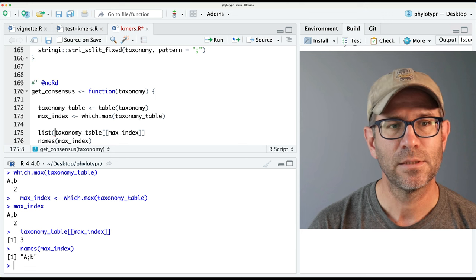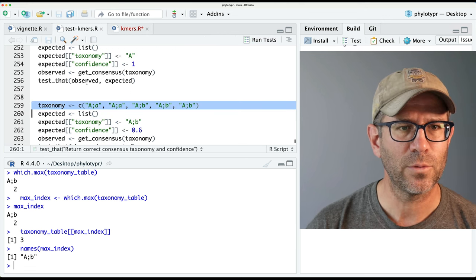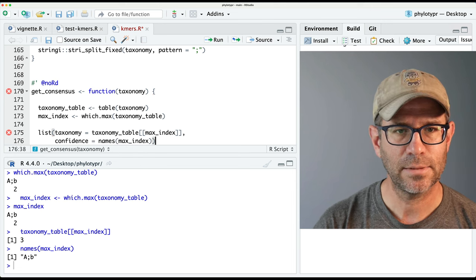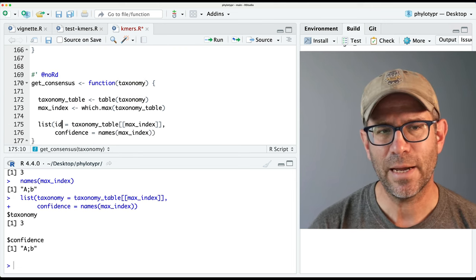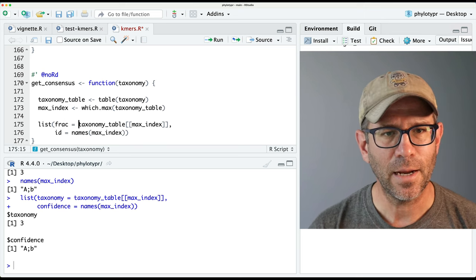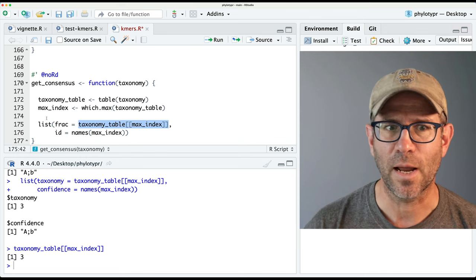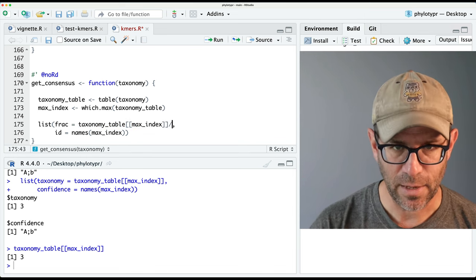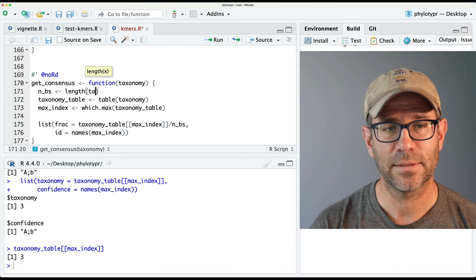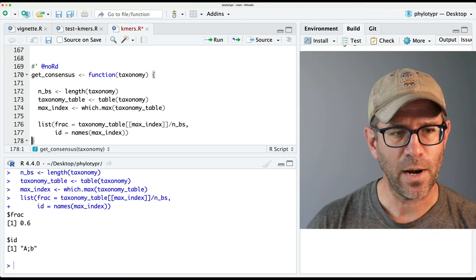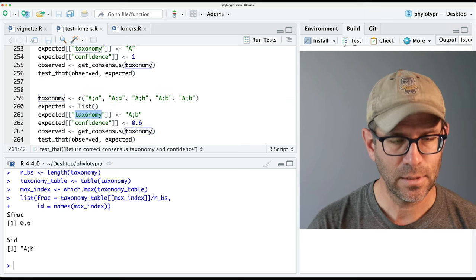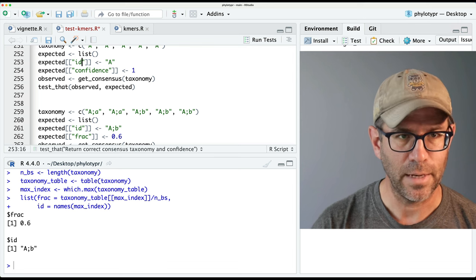Now we're going to return this as a list. The arguments I gave it were id and frac. So we'll say id equals that, and then frac equals that. But I haven't divided by the total number of bootstraps yet, so maybe what I'll do is divide by n_bs, where n_bs is length on taxonomy. That will return frac as 0.6 and the id as a semicolon B. I'll come back to the test and make sure we've got id and frac correctly matched.